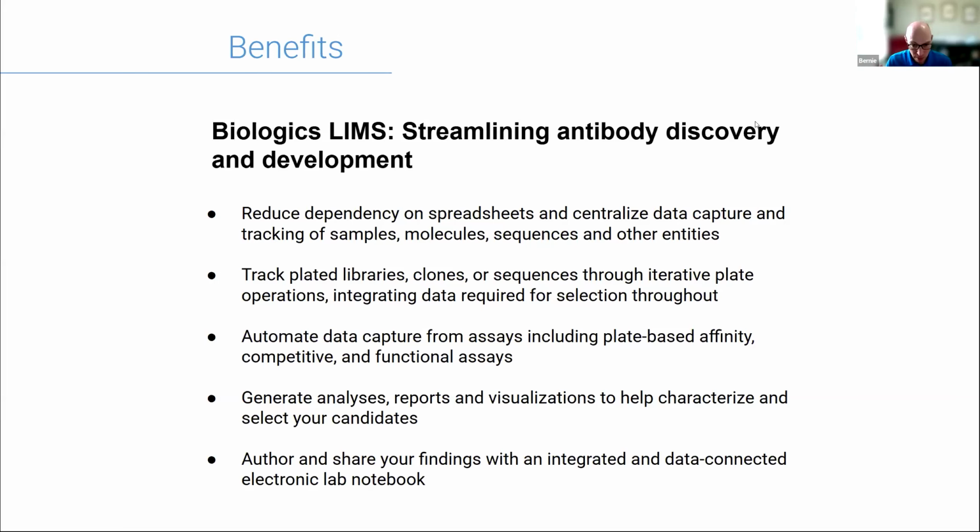Again, we have this integrated data connected ELN that's built into the same system in which you're capturing your actual data, so that you can comprehensively document and report your findings. And what you ultimately end up with are fewer regenerated reports, happier scientists, happier managerial staff, much happier data scientists, and ultimately a lot less energy is required for you to be successful in your scientific endeavor.